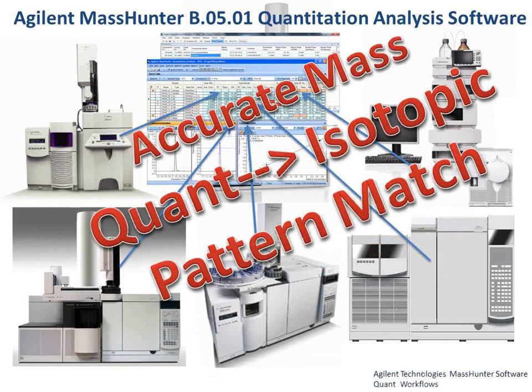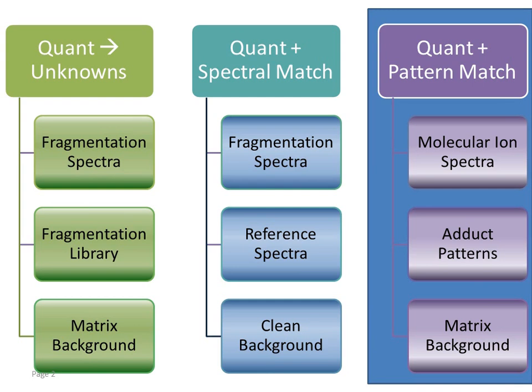Let me introduce you to the Accurate Mass Quant Isotopic Pattern Match workflow. And the context here is we have several workflows in Quant, including its cousin, which is the Quant Spectral Match workflow. And I'm going to be specific here about the pattern match workflow.